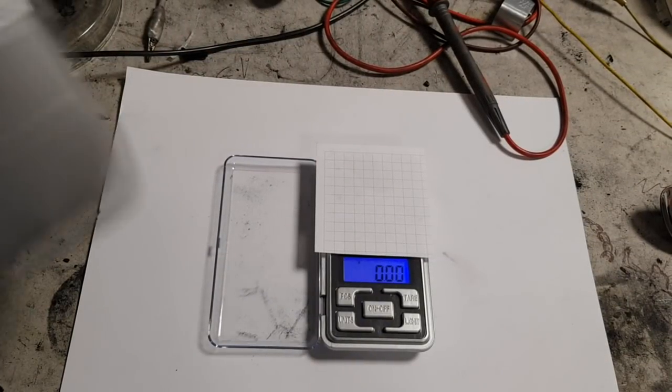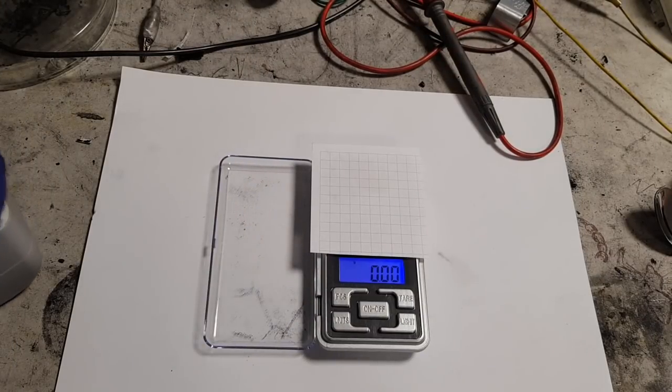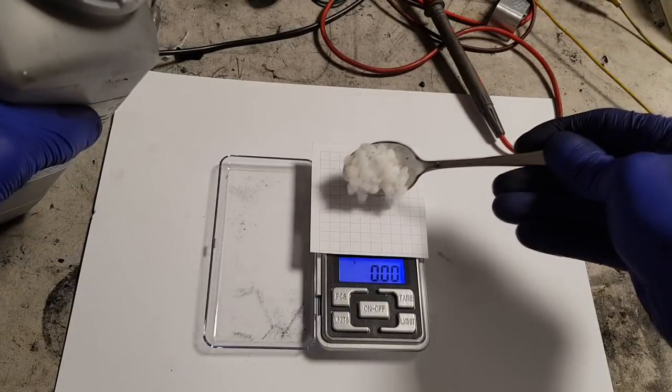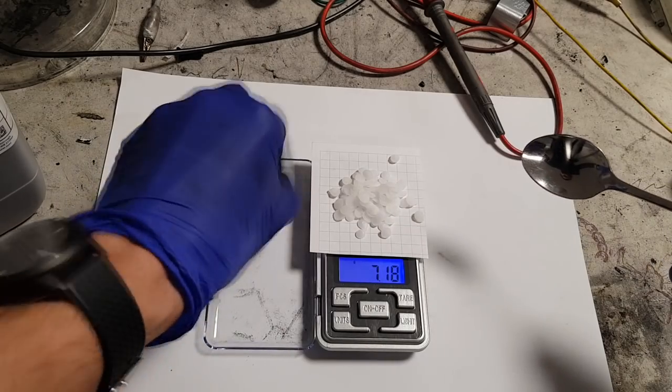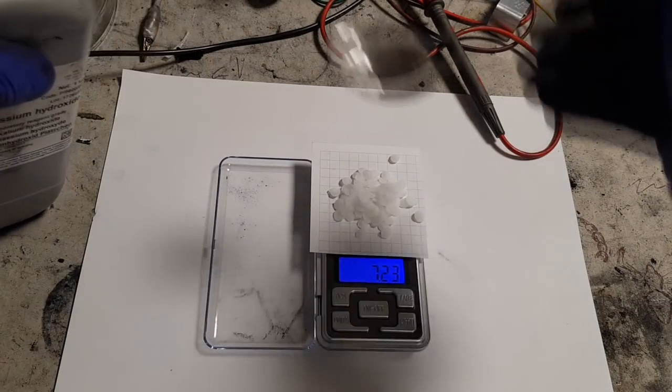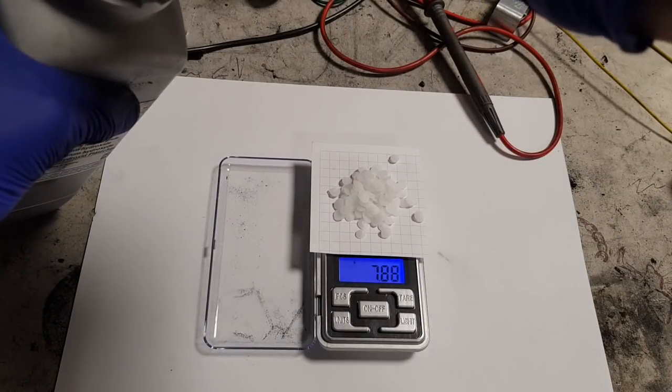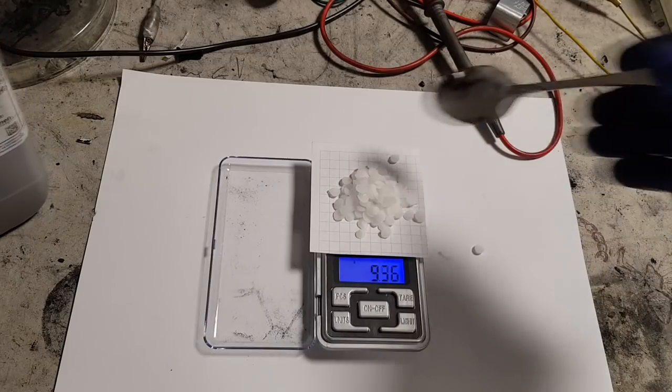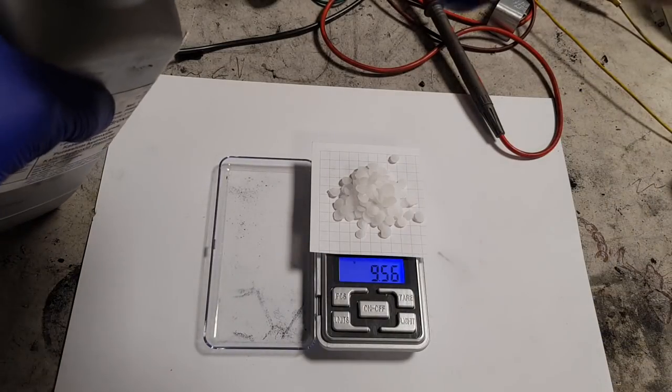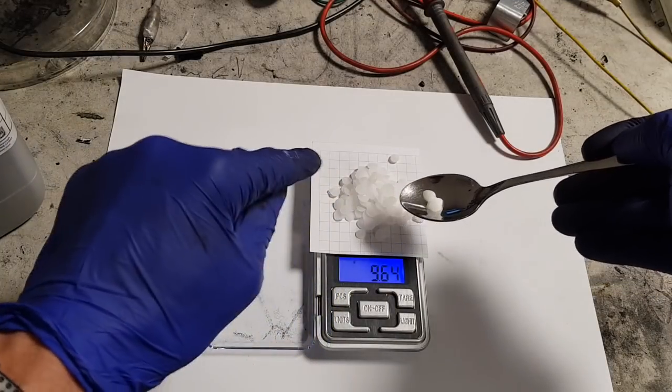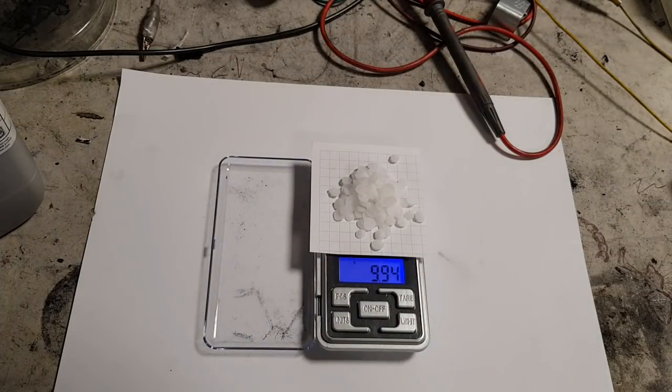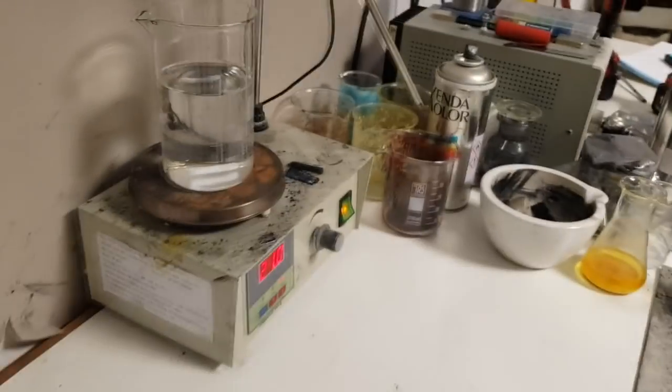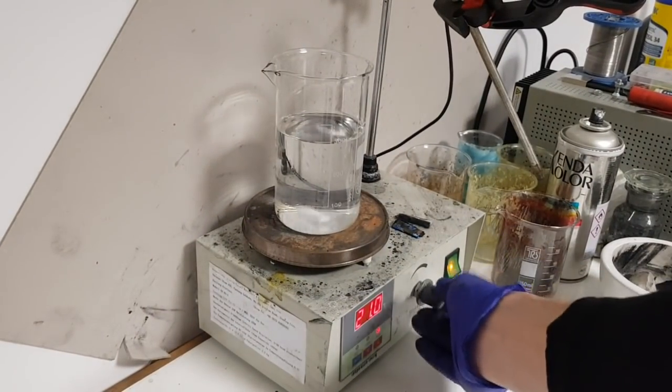measure the quantity of potassium hydroxide. We need 10 grams of potassium hydroxide. So right now I have 10 grams of potassium hydroxide which I will put here. I will start with mixing.